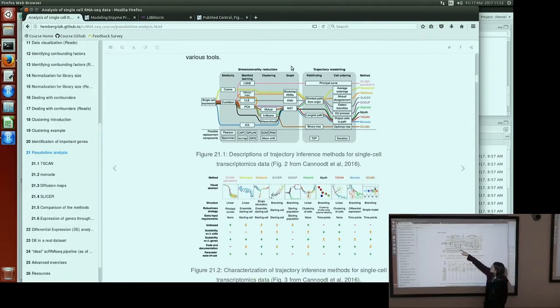You may perform clustering on it as well, and/or create some sort of graph linking all of the cells together based on their similarity, and then using some sort of path-finding algorithm, try and find a route from one end of that network to the other end.